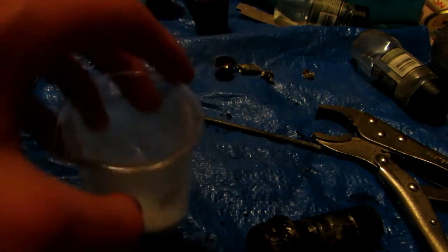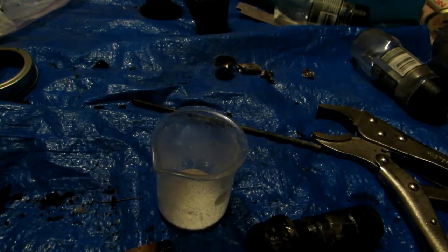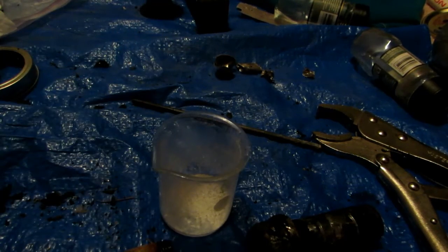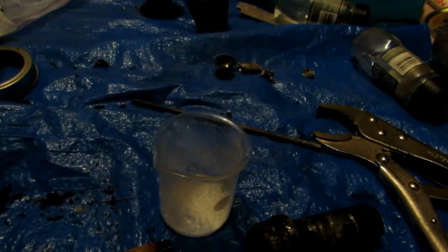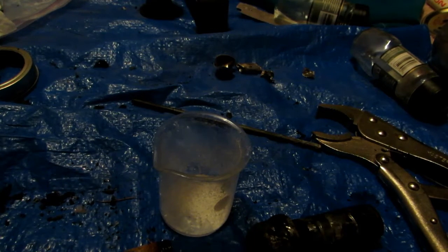I boiled it down in a beaker on my stove and we're left with a beautiful powder. I did break it up as it was stuck to the bottom, but that's fine. This powder is definitely potassium carbonate and I'm super excited about it. The yield wasn't exceptionally high, but I'm not sure if we lost any due to the really high temperatures. For the next test, I'll simply take a crucible and heat it with a blowtorch rather than using the more energy-intensive distillation apparatus.